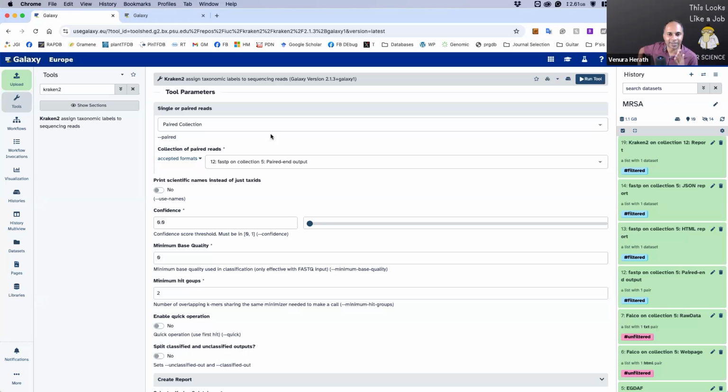Please go from the beginning to the end of the tutorial, because starting from next week we are going to assemble a genome. This is a very crude version of what we did. We were mostly identifying, but as the last part of your course, we are going to assemble a genome, and you will be getting your own customized genome.